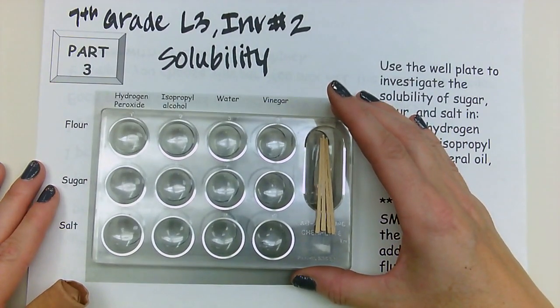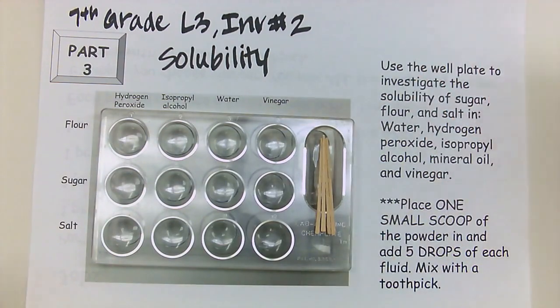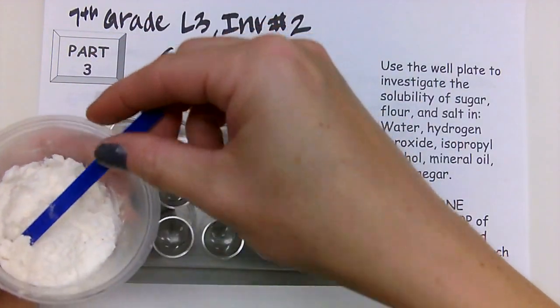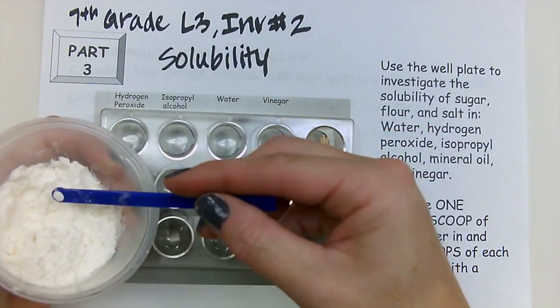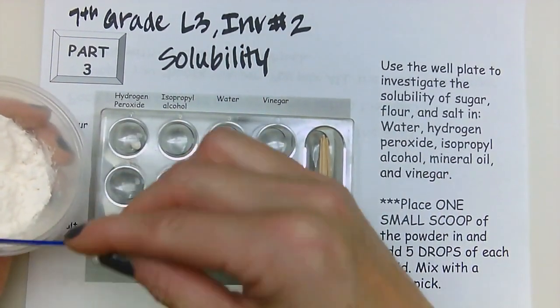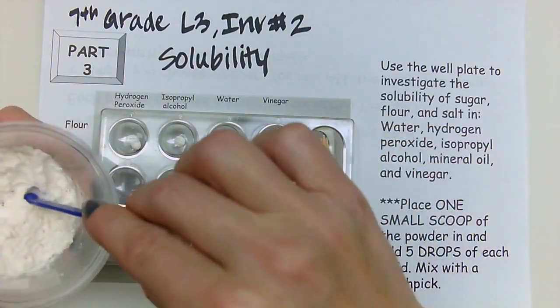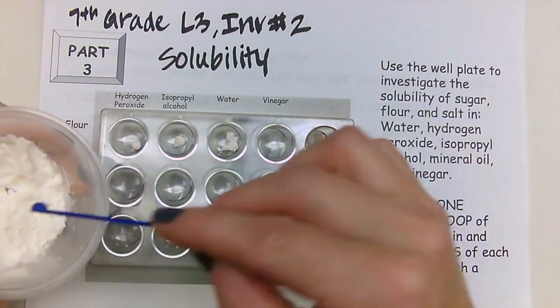So we are going to put everything in here so you can decide who's going to scoop the flour, okay? So each person who is scooping the flour, they scoop the flour. So we're going to scoop the flour and put 1 small scoop and kind of flatten it out like this, okay? And you do 4 small scoops, 1 in each well.